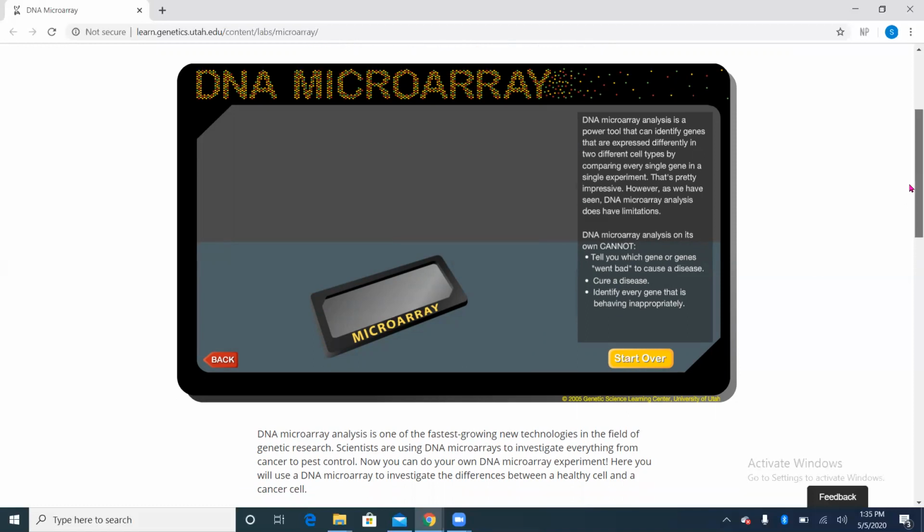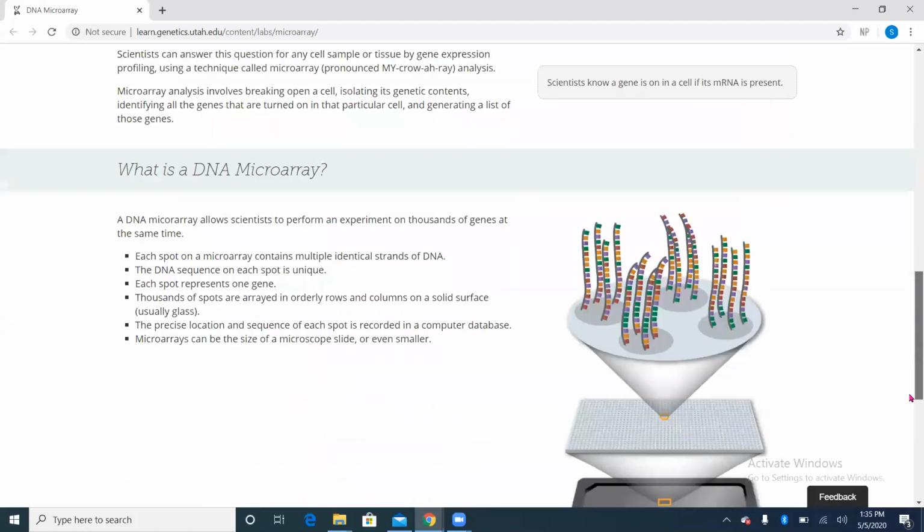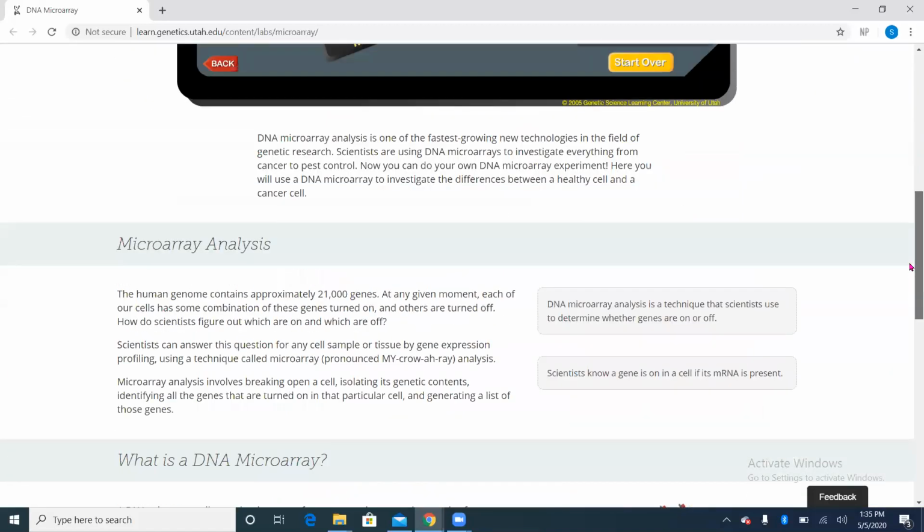All right, since you can pull up this page, you can go through and read the rest of this information on your own. We don't need to do that in the video.